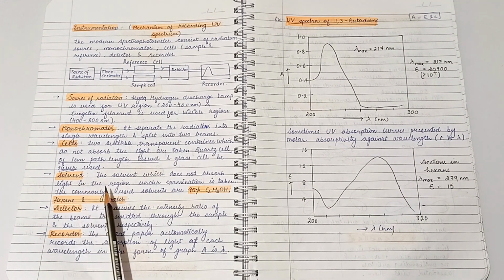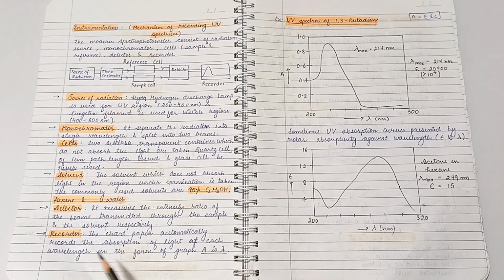Solvent: the solvent which does not absorb light in the region under examination is taken. The commonly used solvents are 95% ethanol, hexane, and water. Then comes the detector. It measures the intensity ratio of the beams transmitted through the sample and the solvent respectively. The recorder: the chart paper automatically records the absorption of light at each wavelength in the form of a graph of A versus lambda.